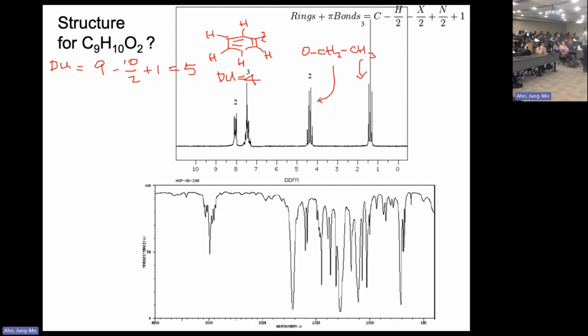That means this carbon must have an oxygen. Nothing else can pull this far other than oxygen. The CH3 already made a bond, so you cannot put oxygen there. So that's a substructure coming out here. But this does not say anything about the 1 degree of unsaturation. We still need to find out.